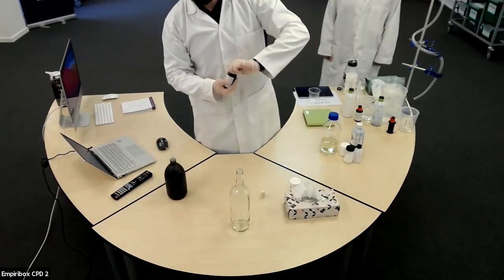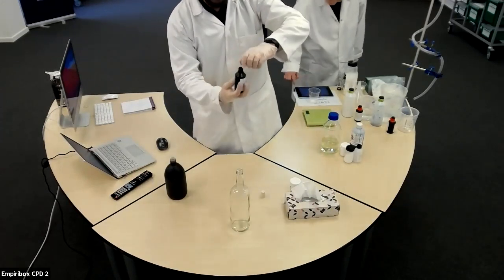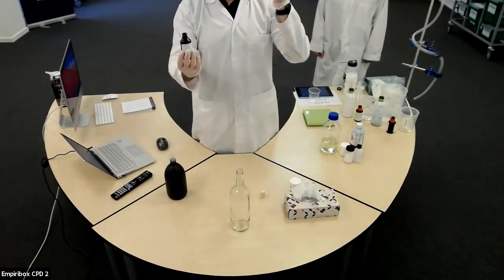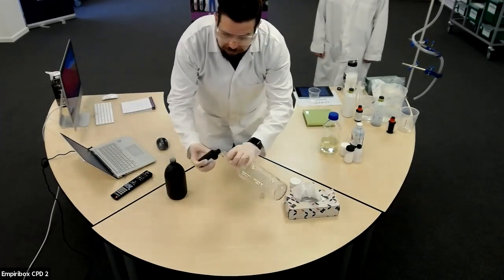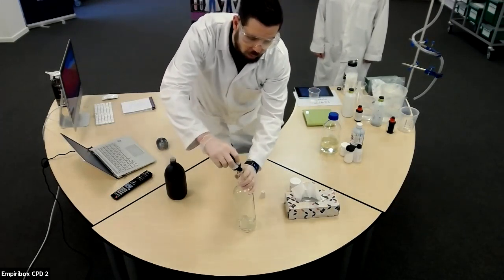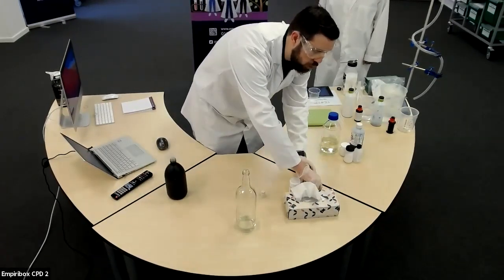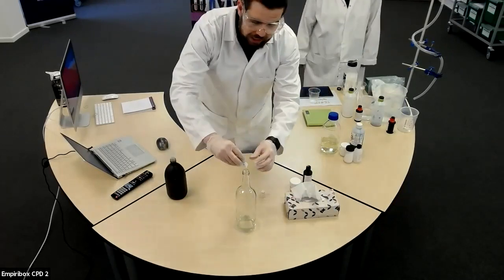Yes, first, because two compounds are reacting to make smoke. You're absolutely correct. Now, what I've got here is something known as hydrogen peroxide. It's the same chemical that hairdressers use to make your hair go blonde. So I'm going to pour all of the chemical inside my bottle right here. And then the second chemical I'm going to use is something called manganese oxide. I've got a little pocket of it here.